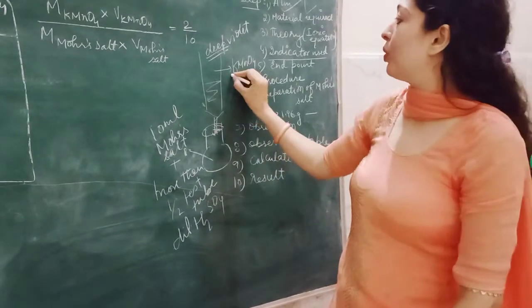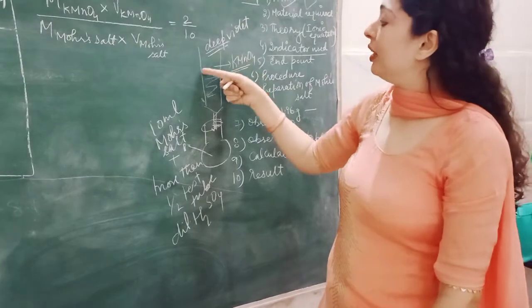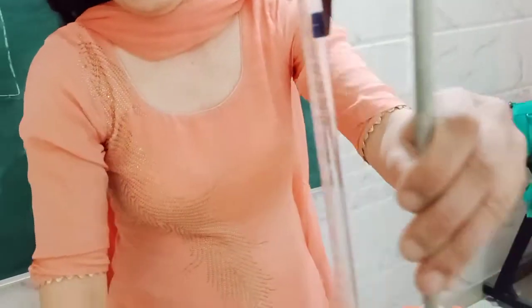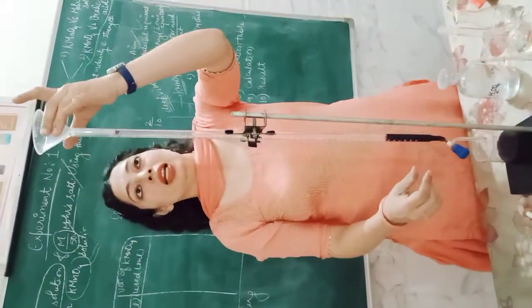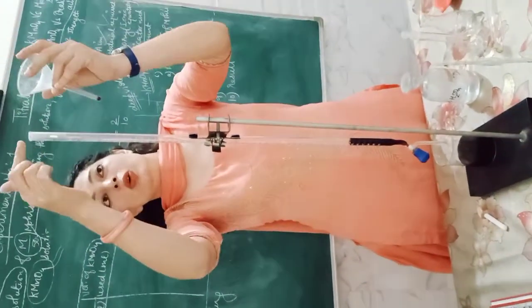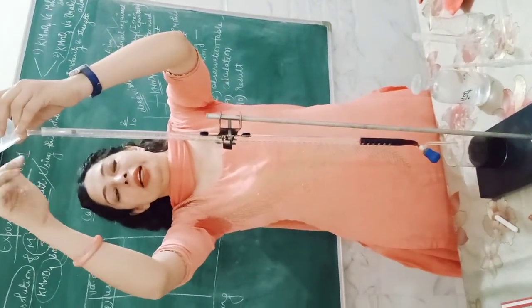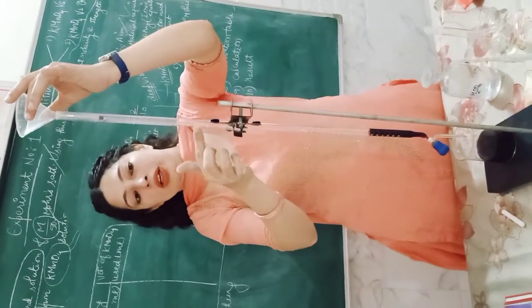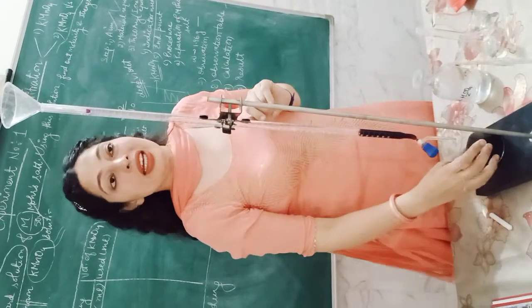The first point is: fill KMnO4 first — you will rinse the burette. This is your setup arrangement. There is a funnel, and you will use this funnel. Wash the burette first with water, then rinse it with KMnO4.